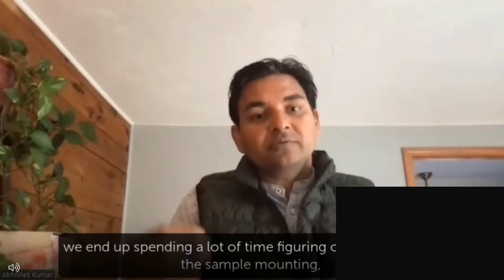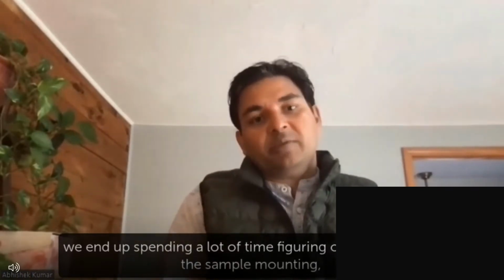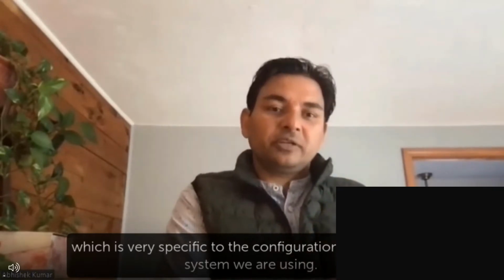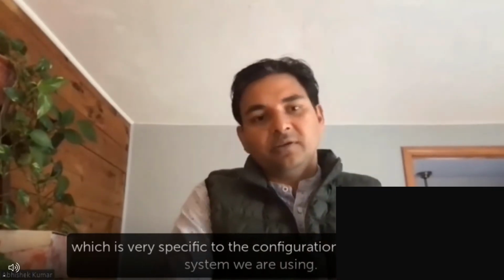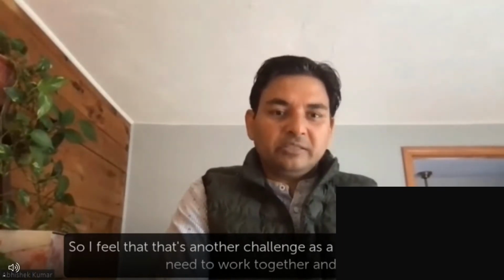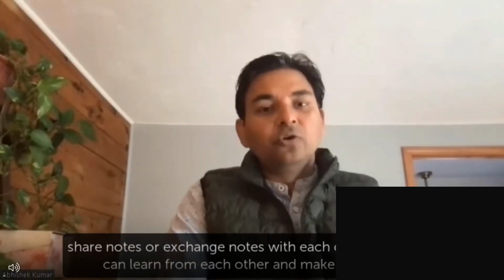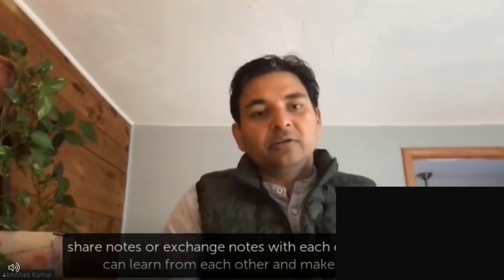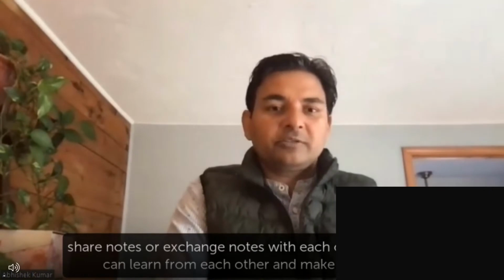So in many cases when we work with new samples or new organisms, we end up spending a lot of time figuring out or optimizing the sample mounting, which is very specific to the configuration of the light sheet system we are using. So I feel that that's another challenge. As a community, we need to work together and share notes or exchange notes with each other so that we can learn from each other and make progress.